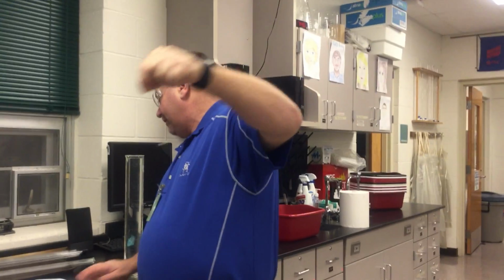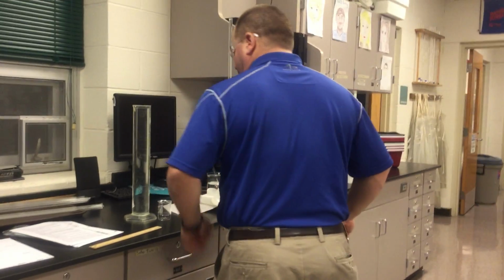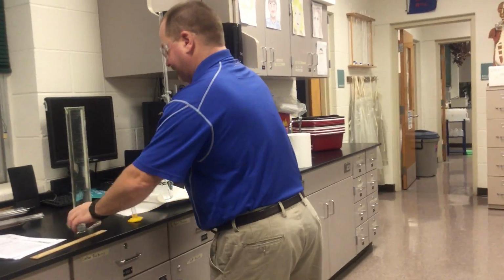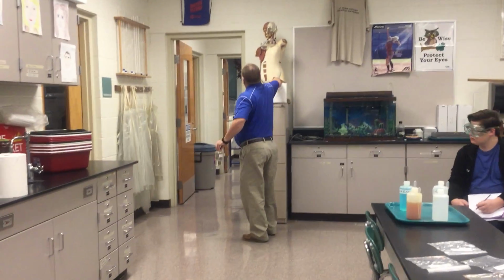All right, now I'm going to set that down, and it says to obtain 10 milliliters of a 6 molar hydrochloric acid and put it in a 50 milliliter beaker. So, 6 molar is a kind of concentrated hydrochloric acid, okay? I don't need the fume hood.